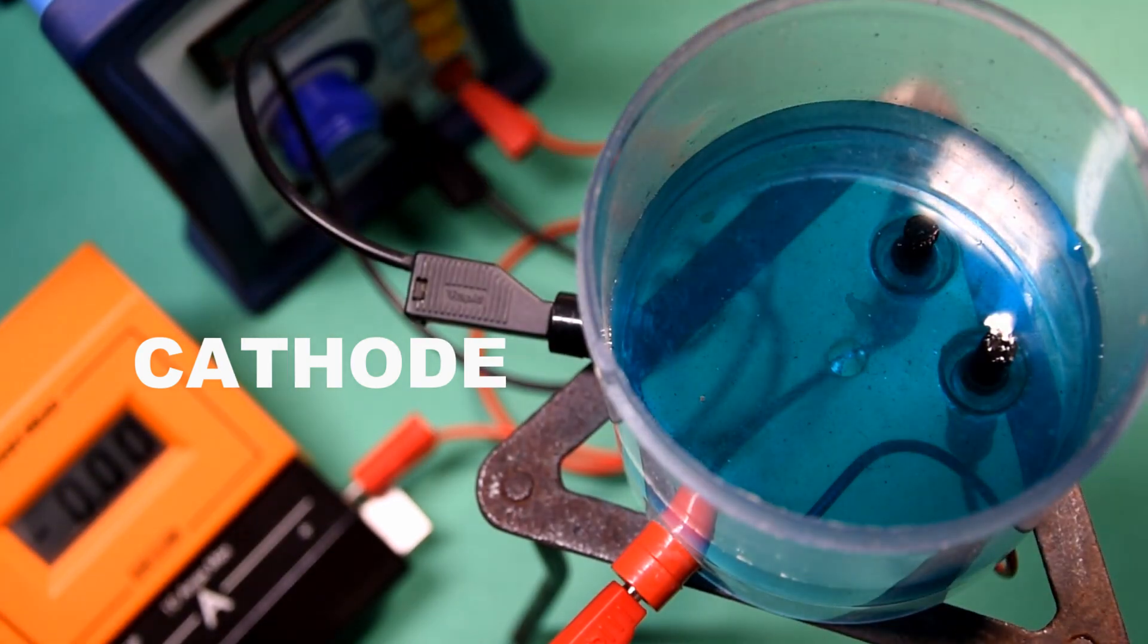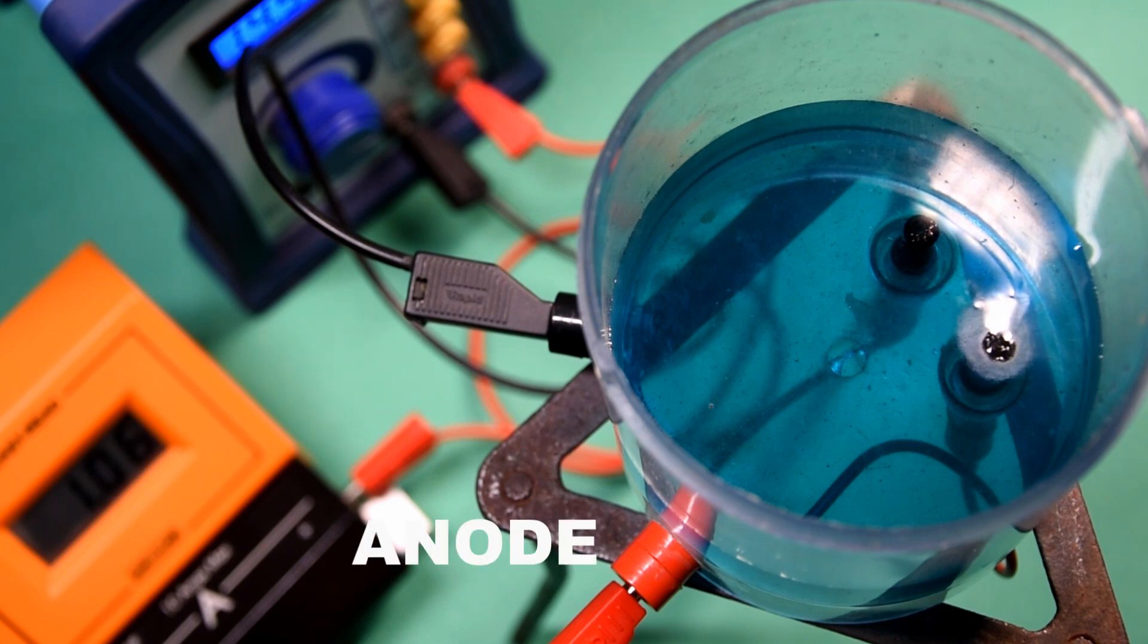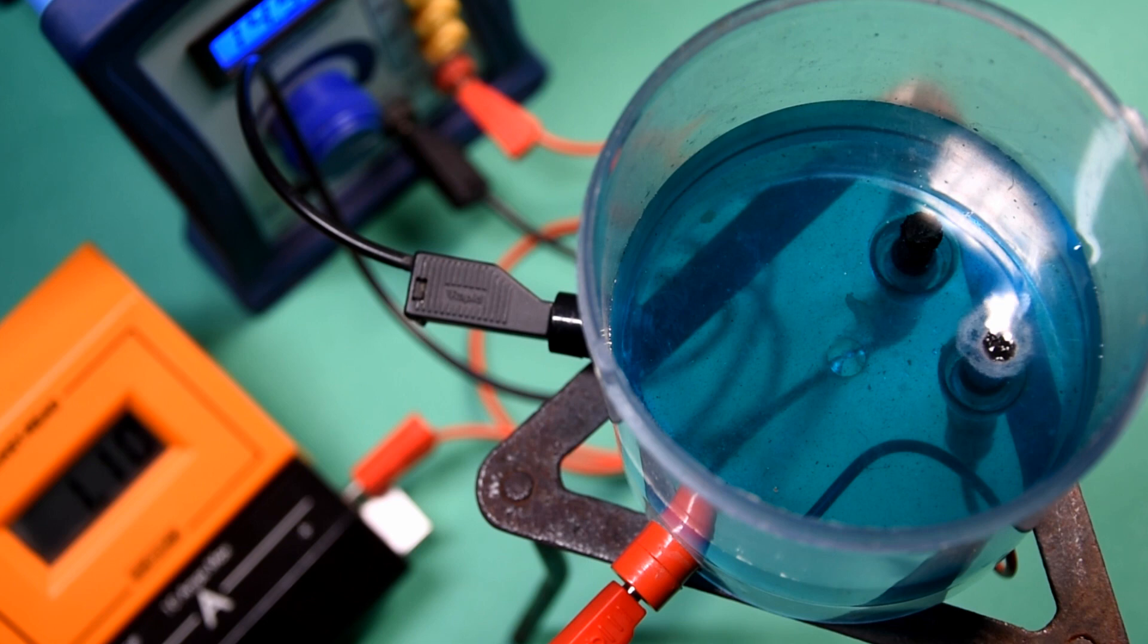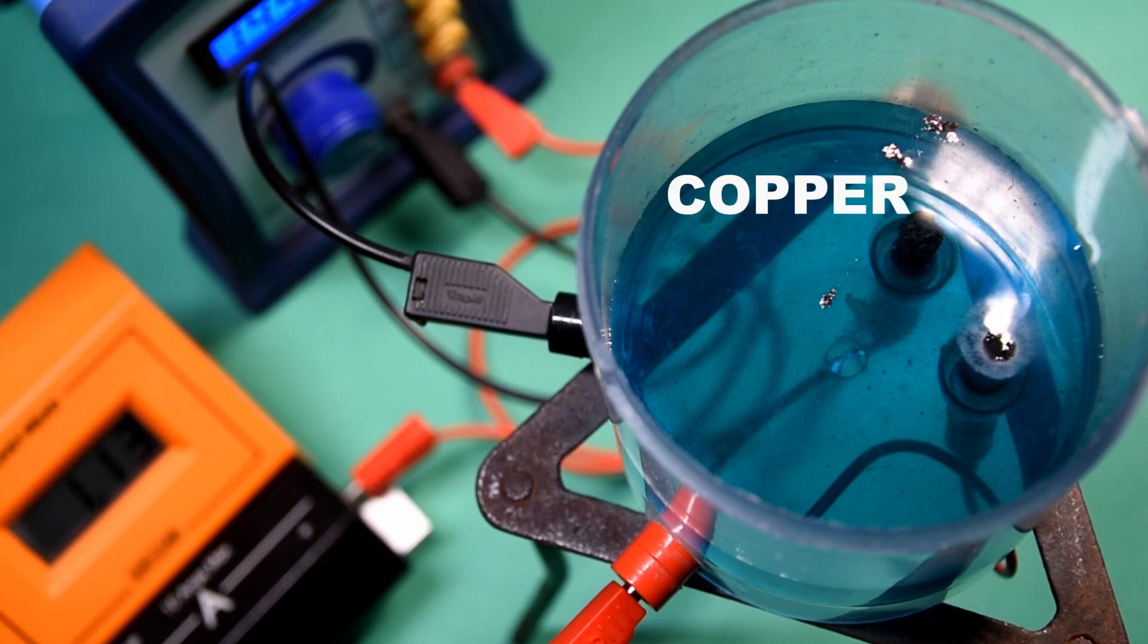Copper sulphate is poured into a beaker with two inert carbon electrodes and a current passed through. It's possible to see the oxygen bubbling at the positive anode. And after a while, the copper becomes apparent at the negative cathode.